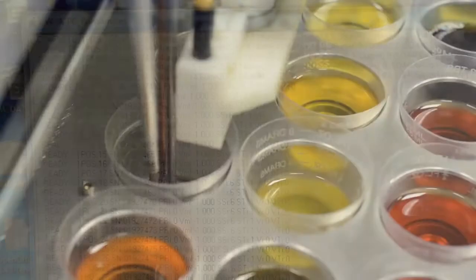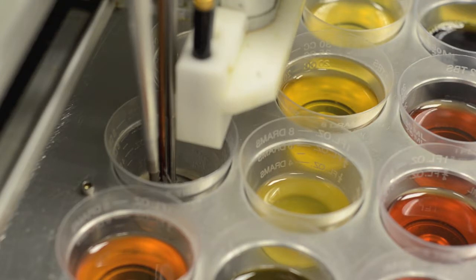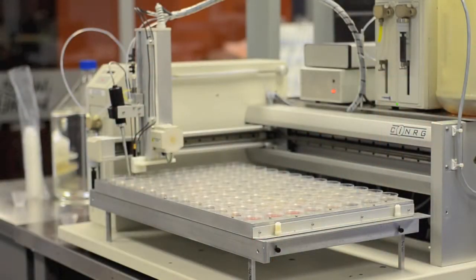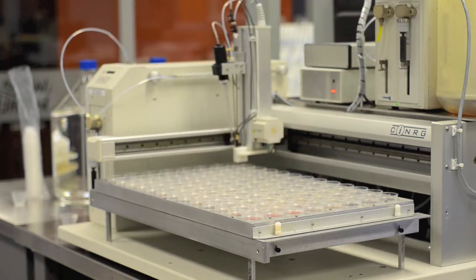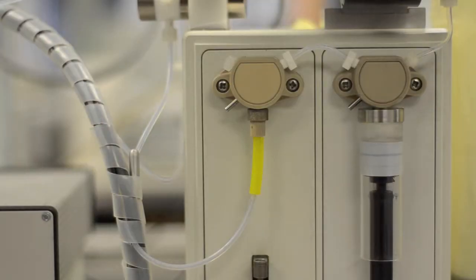The current sample cup is filled with a small amount of solvent to flush the sampling head, after which any remaining solvent and sample is expelled to waste. The sampling head then returns to position 1 where a cleaning cycle is implemented. Then proceeds to the next sample.